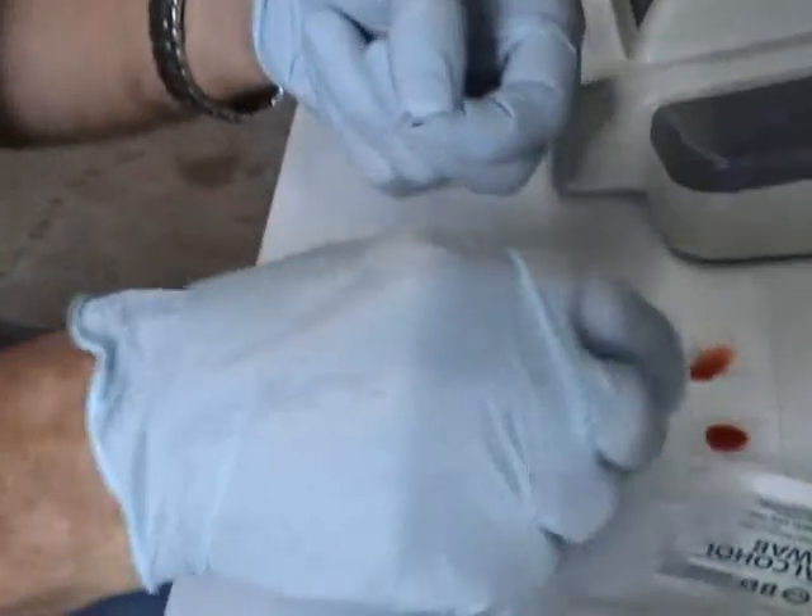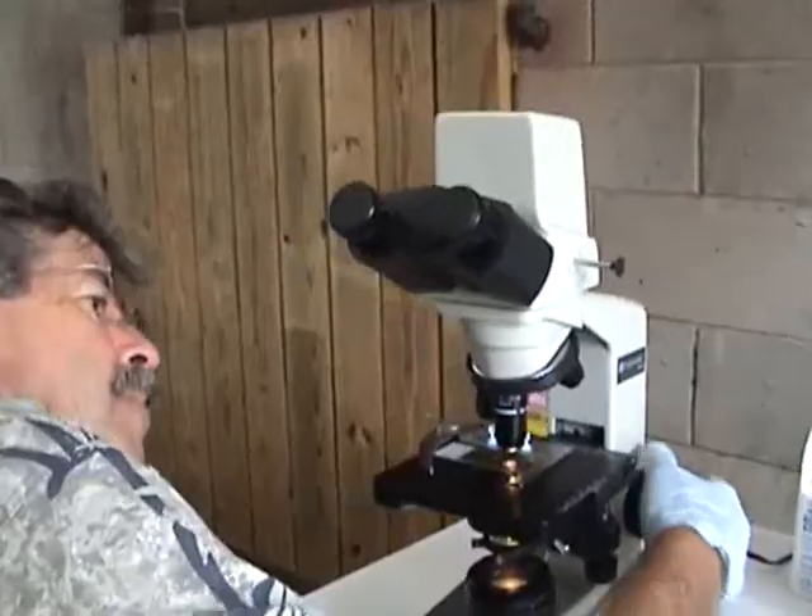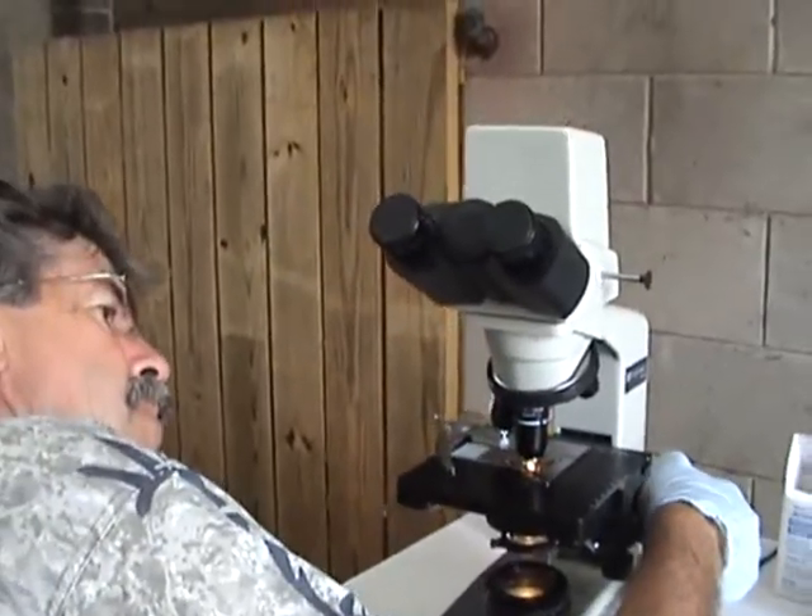You take two samples, correct? Correct. An eighth of an inch, or a quarter of an inch. Yeah, you don't go very far. Yeah.